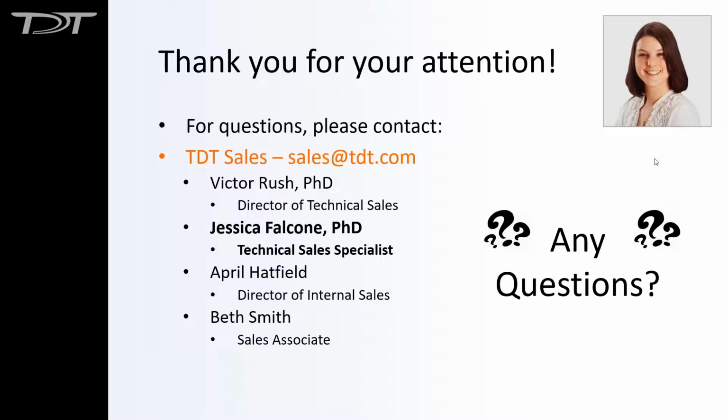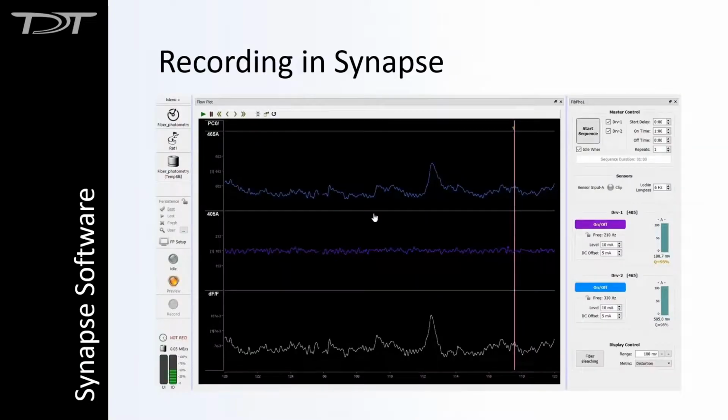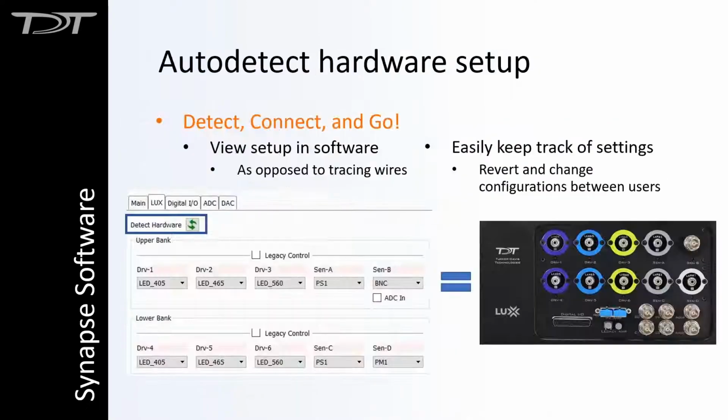And Mia Anderson wanted to know if the time on the pre-bleaching allowed for control of both the onset and the offset of the LED. The photo bleaching is separate from the timing control.